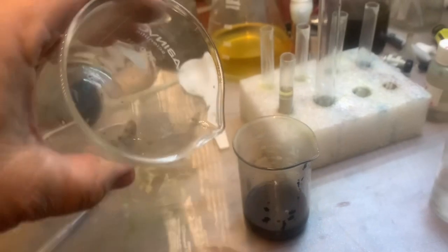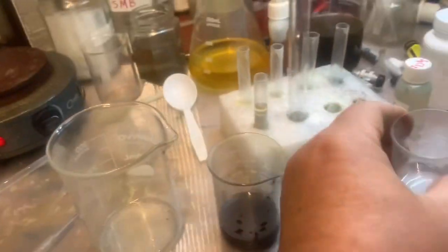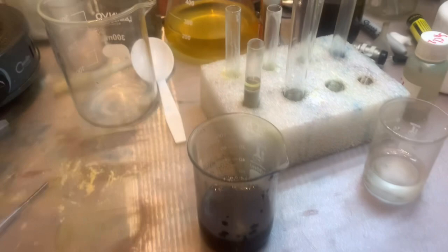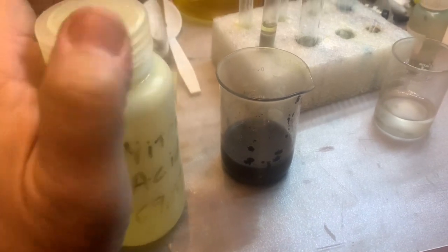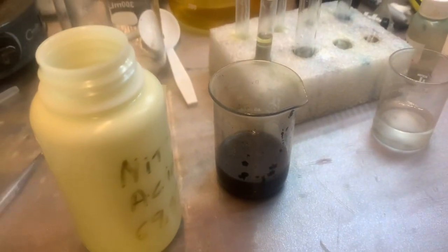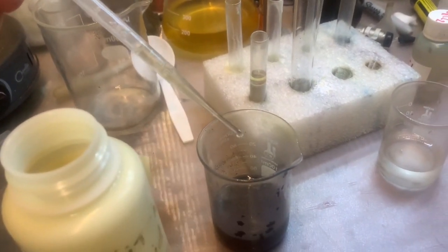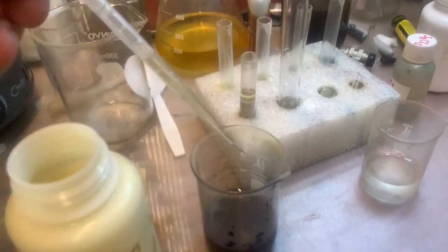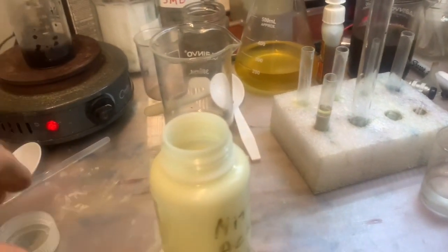Okay. One more time. This is hydrochloric acid. Okay. So we got a lot of juice anyway. And now I decided to put some nitric acid because I don't want to mix too much solution. So minimum, let's get about 2 milliliters. Okay, 2 milliliters of nitric acid. And that's it. Putting on the heat. Let him dissolve.